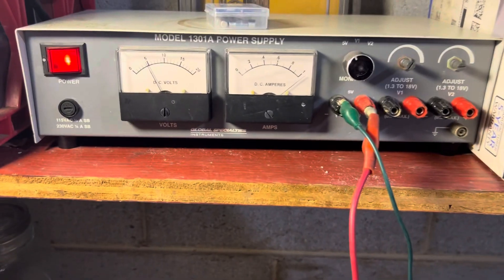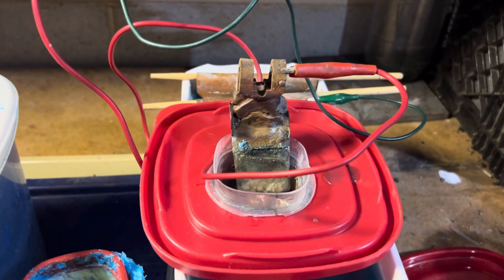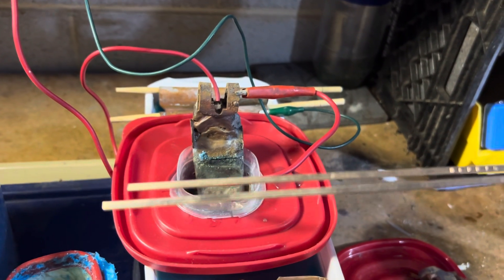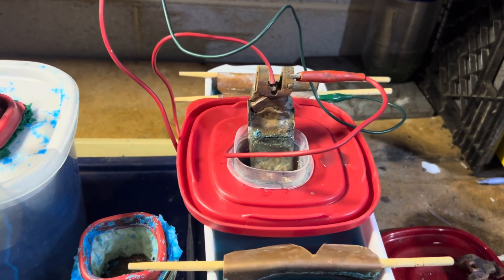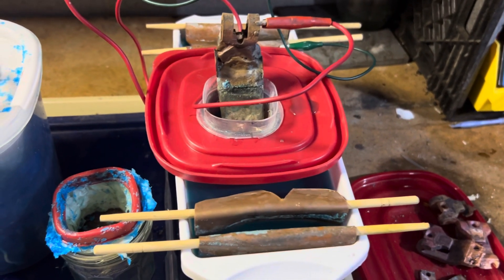We're going to turn it on. I'm running it at four volts, four and a half volts, one amp. We are going to recover the silver from this. This is silver floss — it's about 15% silver, 85% copper, and a little bit of phosphorus for the flux.